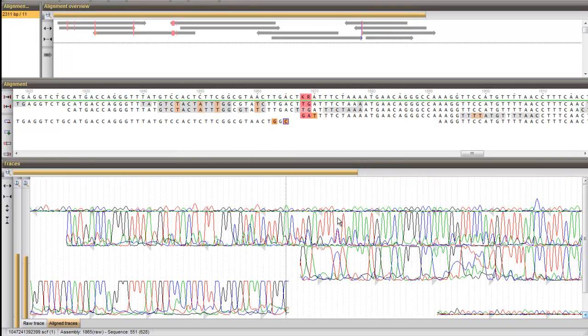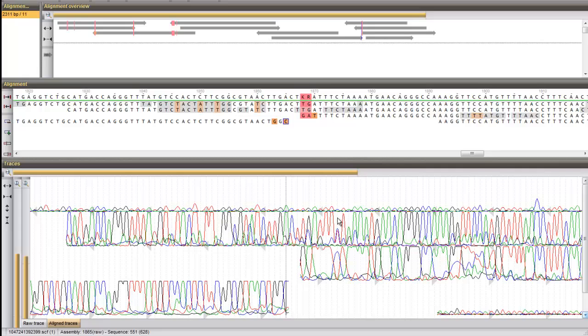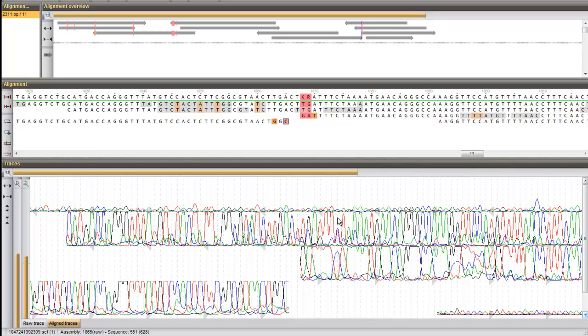Unresolved positions on the consensus are indicated in pink. Clicking on such a position allows you to examine the corresponding chromatogram peaks and make base calling corrections if desired.